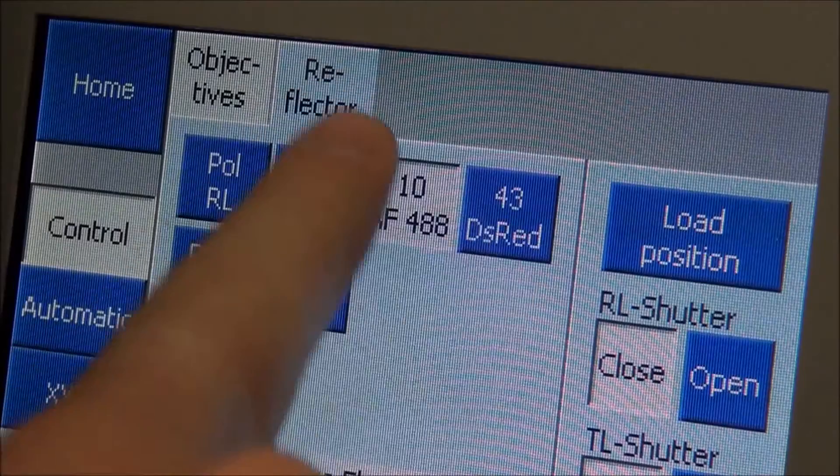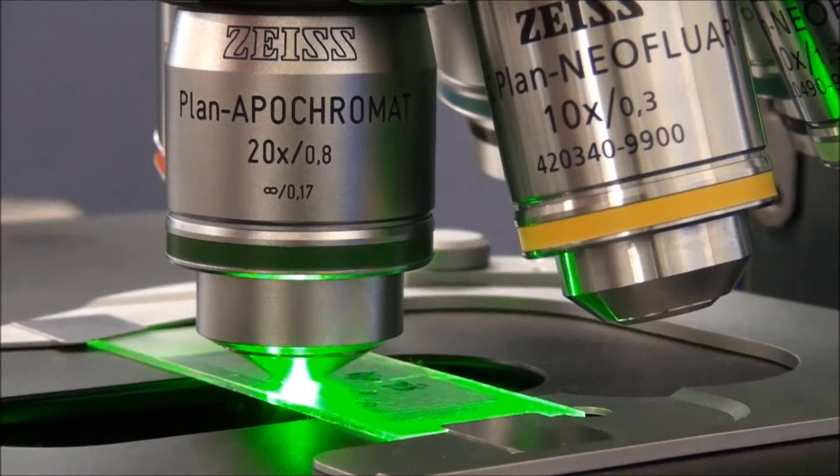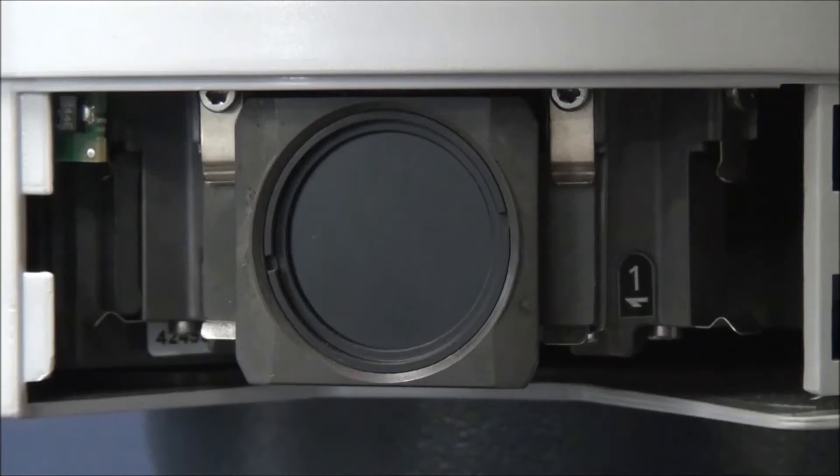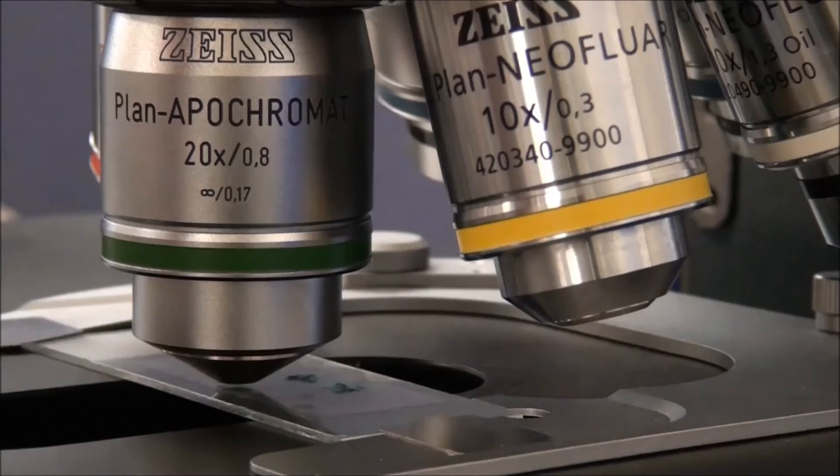Some microscopy techniques require a way to reflect light to a sample or manipulate that light before it reaches your eyes or a camera. For that reason, push and click reflector modules, otherwise known as filter cubes, are installed in the microscope.